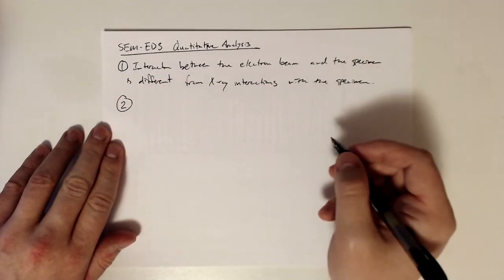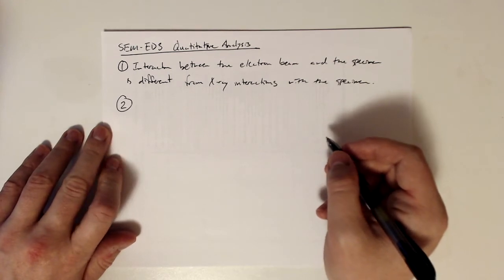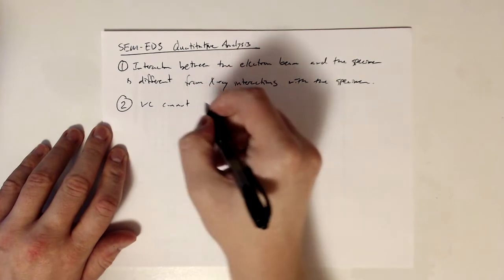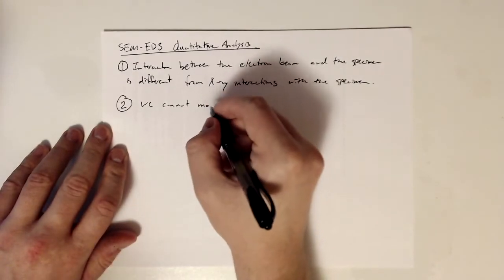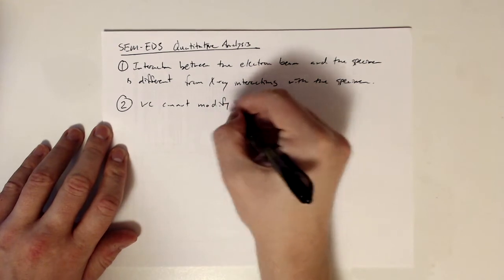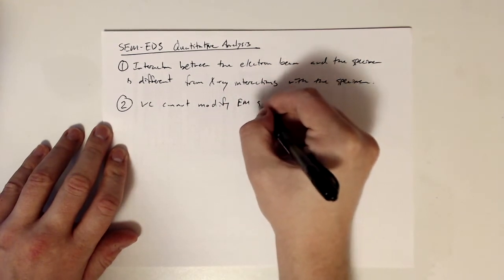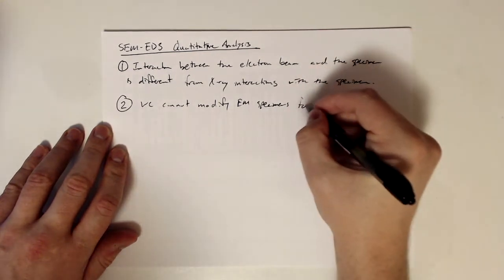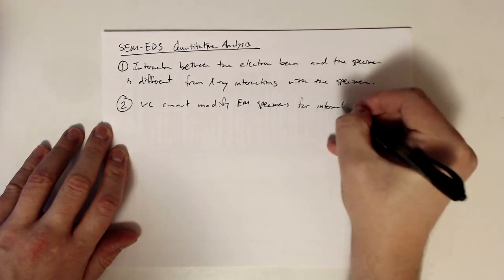Secondly, we can't modify our specimens in the same way. So we can't use the internal standard method.